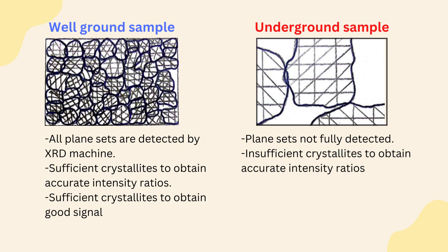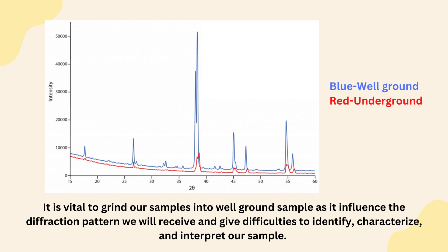For well ground samples, all plane sets are detected by the XRD machine. Thus, it has sufficient crystallites to obtain accurate intensity ratios and to obtain a good signal. For underground samples, the plane sets are not fully detected, and thus it has insufficient crystallites to obtain accurate intensity ratios. In conclusion, it is vital to grind our samples into well ground samples as it influences the diffraction pattern we will receive and gives difficulties to identify, characterize, and interpret our sample.